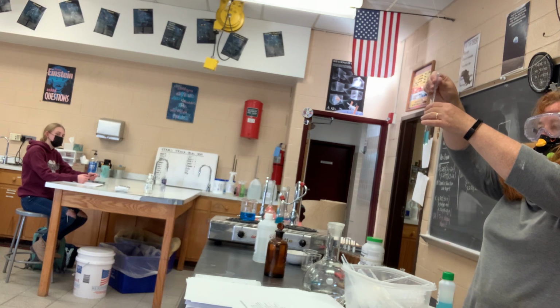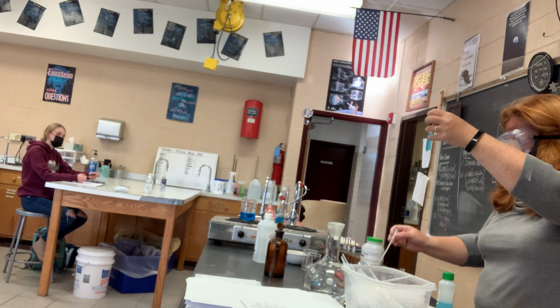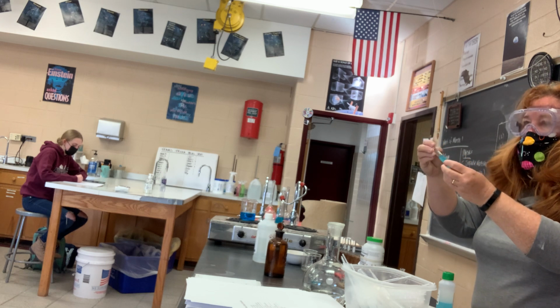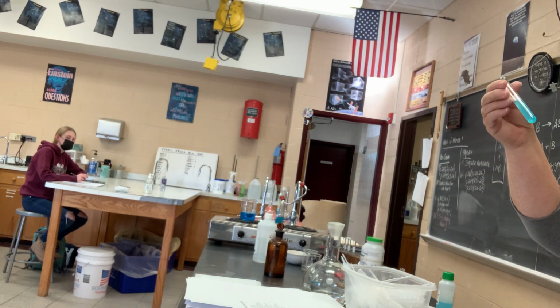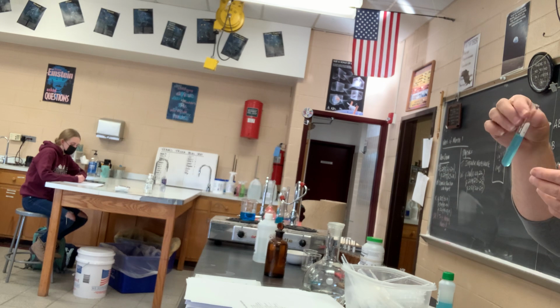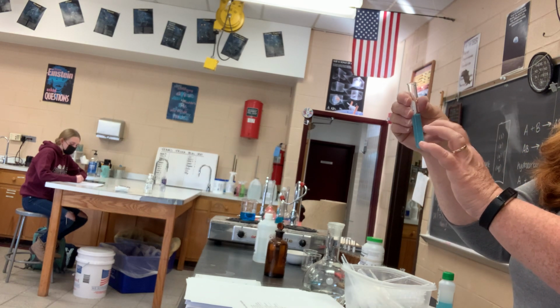Okay. It makes a gel. I'll pass this around. You really can't hurt yourself with this. It's really hard, so I'll probably throw the test tube away. It makes this gelatinous pale blue stuff. I guess it's a solid. But I'll pass it around. You can tip it a little bit and see it's not moving very much.